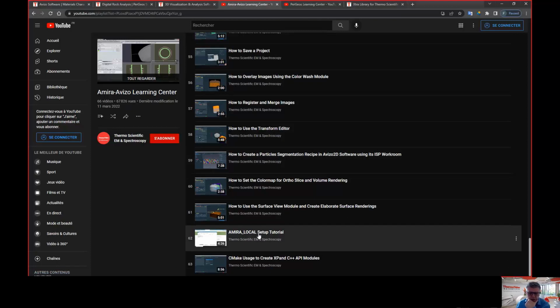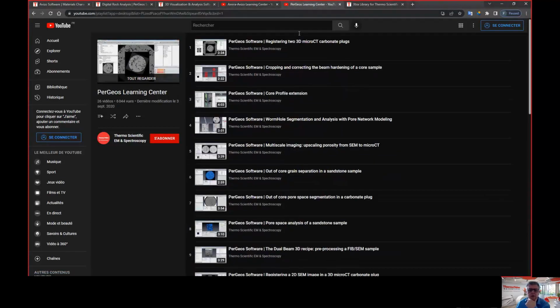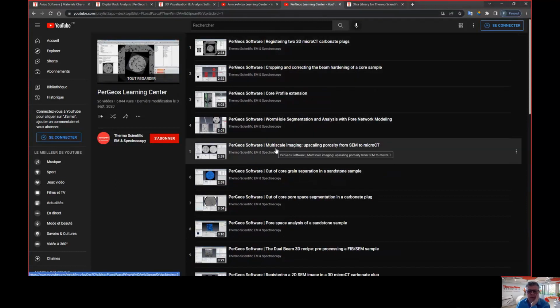This one is important. You get, how do I set up to be able to extend Avizo and PerGeos? So you need this special directory. You have to tell Avizo and PerGeos where their special directory is. PerGeos Learning Center, same thing. You get a lot of stuff we didn't speak about yet.